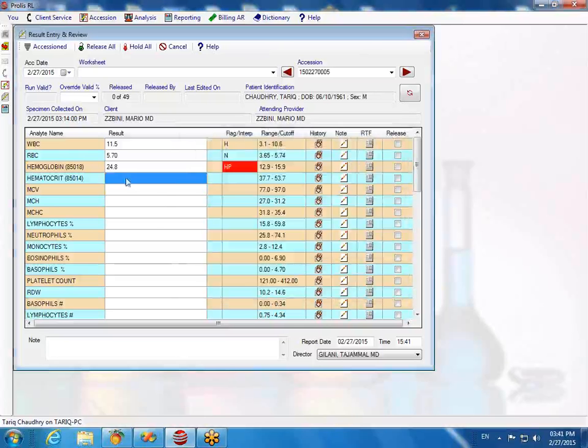System is going to save it for you. Okay. Eric, let me interject here. I think you sold it to us. This has good features. Let's go to an interface. Okay. No, actually, I'm sorry. I will go to the interface, but I want to show you something else. Okay, all right. Which a lot of other people claim, but actually they don't have it. We have a very special feature for toxicology. Since you guys are toxicology people, yes, I would say you should see this feature, okay?